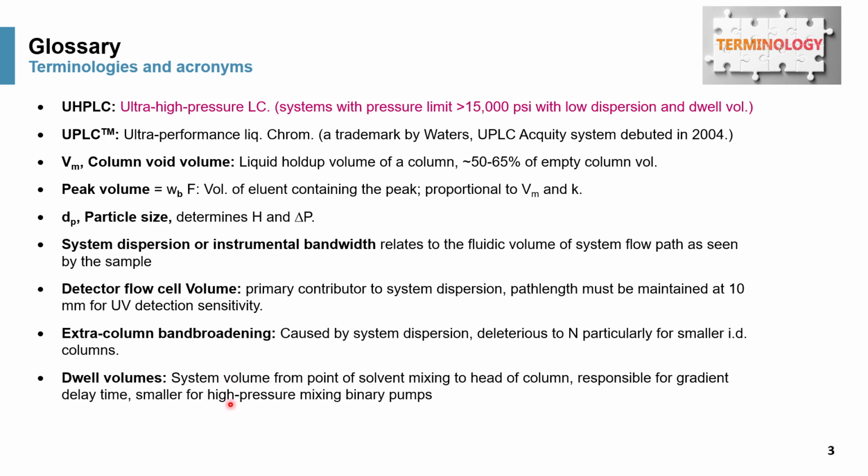Dwell volume is defined as the system volume from the point of solvent mixing to the head of the column. It is responsible for the gradient delay volume. Dwell volumes are typically smaller, definitely smaller, for high pressure mixing systems with binary pumps.